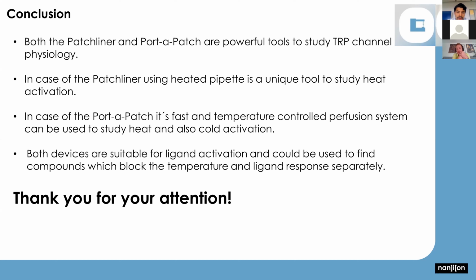Okay. Then another question, have you tried liposome patches in the PortaPatch? Yes, liposomes could be done. It's of course not the easiest application, so you need good preparation for it. But it can be done. We also have application notes about it.